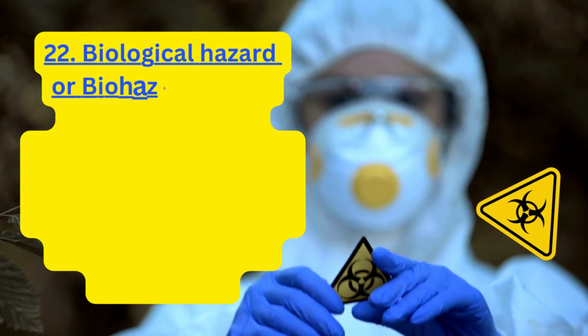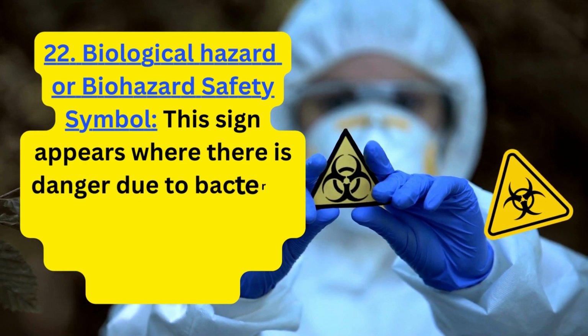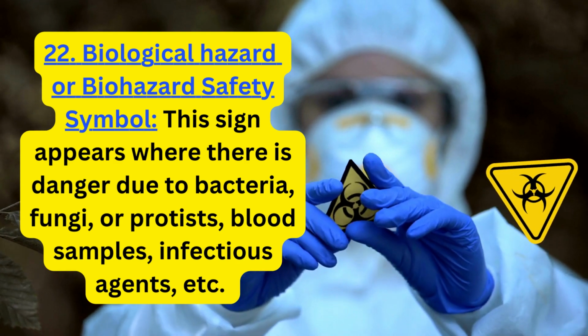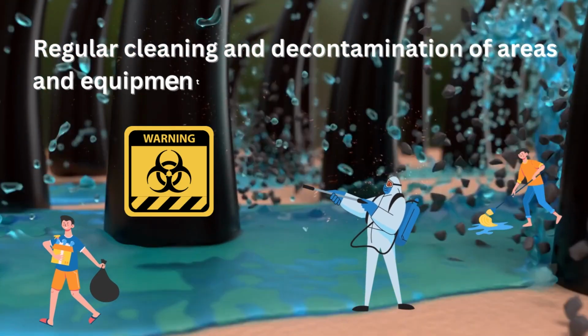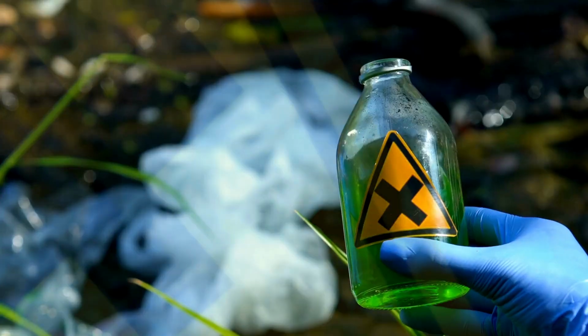22. Biological hazard or biohazard safety symbol. This sign appears where there is danger due to bacteria, fungi, or protists, blood samples, infectious agents, etc. Regular cleaning and decontamination of areas and equipment that are exposed to biohazards is also a must.